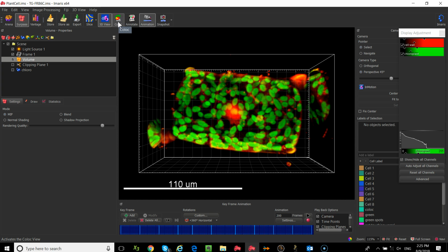In Imaris, we provide two different mechanisms to do co-localization. One is an intensity-based approach, which is available on Fiji and lots of other applications that provides co-localization statistics like Pearson's correlation, Mander's coefficients, percentage co-localization, etc. We also have another approach that we call an object-based approach, which is where you identify the objects of interest and look to measure their interaction or their distance to one another. I would say more nowadays we're seeing people use an object-based approach, but I'm going to start with intensity and then we'll switch to object, okay?